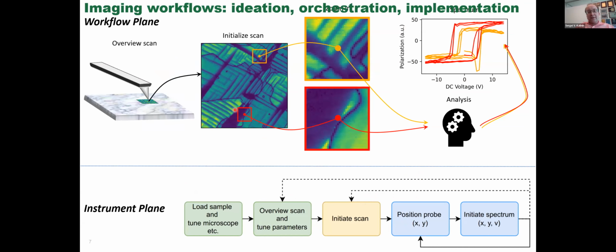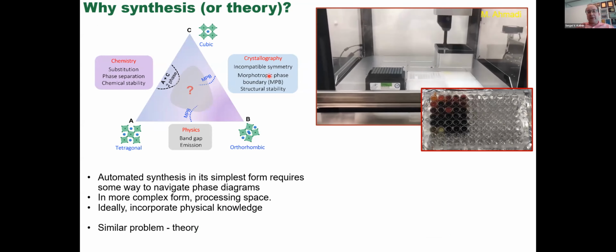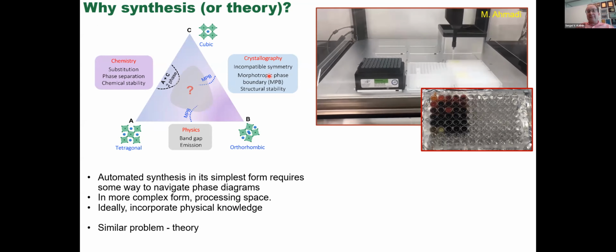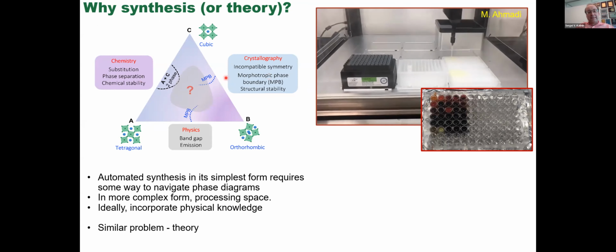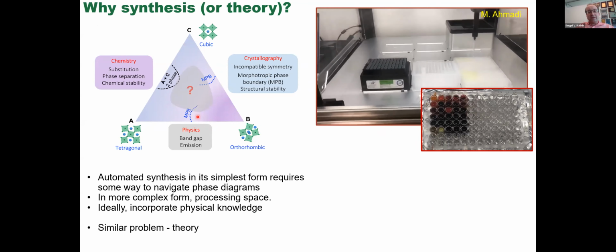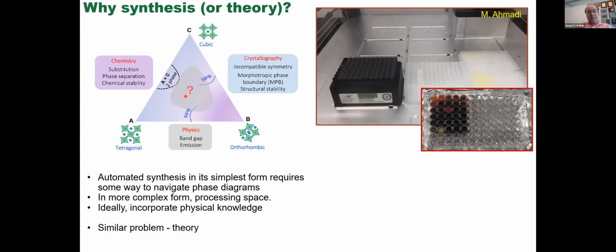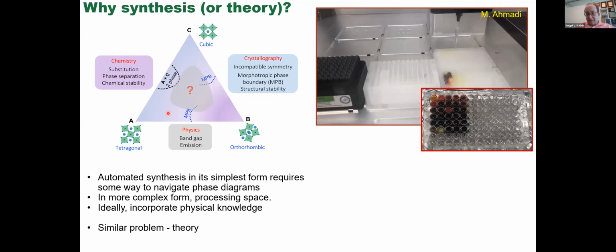And here, the interesting thing is that once you think about how you make machine learning that allows you to make a better microscope, you very quickly come to the realization that these machine learning methods are going to be universal. For example, discovering something interesting in the image plane of the microscope is virtually the same problem as exploring the phase diagram of the hybrid perovskite using the pipetting robot, except that instead of imaging or spectroscopy, you actually select the composition to synthesize.